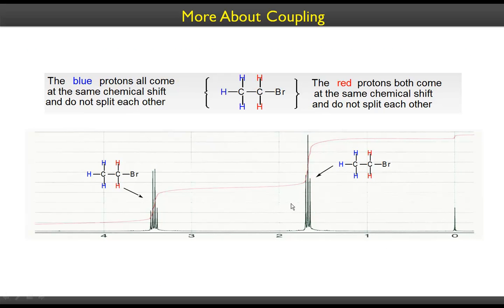Okay, let's take an example here. This is bromoethane. These hydrogens which are colored in red are experiencing 3 local magnetic fields influenced by these 3 small magnetic fields. These are called induced magnetic fields, and as a result they would be split in 4 ways, and that's why this is a quartet, and it is attached to a bromine, so the chemical shift is much higher compared to the other one, which is for methyl. And this methyl group has only 2 neighboring hydrogens, so the N+1 rule tells us that this should be split into 3 ways. That's why it's a triplet.